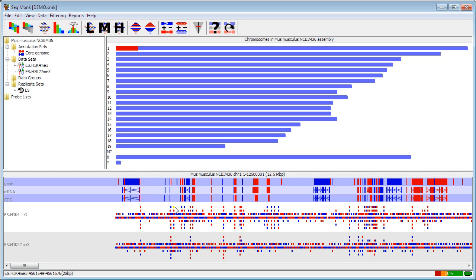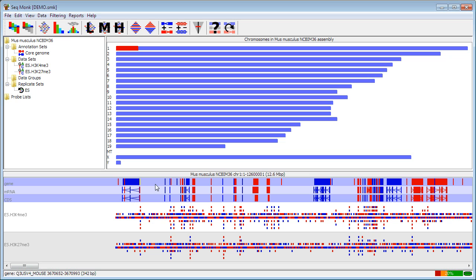When you import data into SeekMonk you will open up a data track for each file that you import and those will open automatically so I can already see my data in here. The colors of the features that you see represent the strand with red tracks running left to right on the top strand and blue features running right to left on the bottom strand. That applies both to features and to reads.